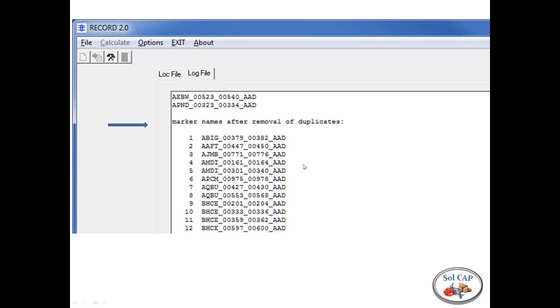And this is really important once you get to really high density maps. I'll give you an example. In Pepper we map 16,000 unigenes, but we only have 2,800 unique haplotypes, or 2,800 genetic bins in that map. So it's a much easier task to map 2,800 than it is 16,000, of course. And then you reassociate after the fact the haplotypes that are the same.